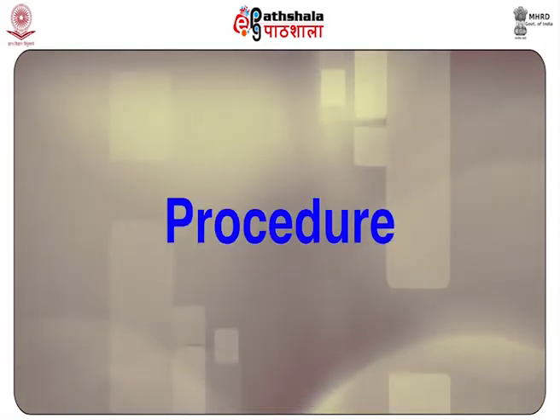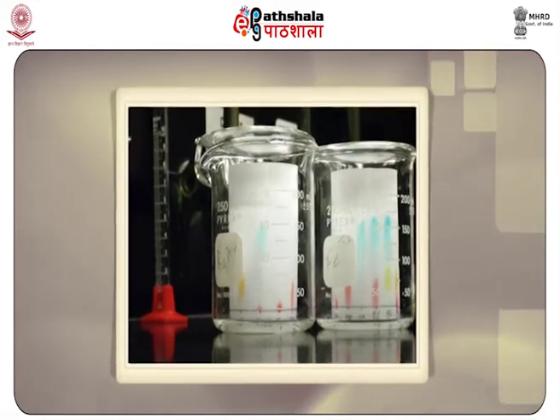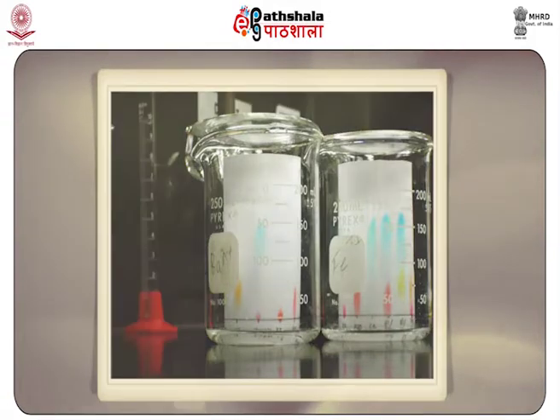Next, moving on to the procedure. The sample under analysis is placed on a filter paper, one end of which is immersed in a solvent. The solvent diffuses up the paper, thereby dissolving and separating the various sample components.